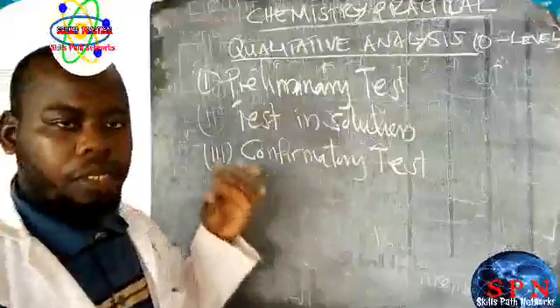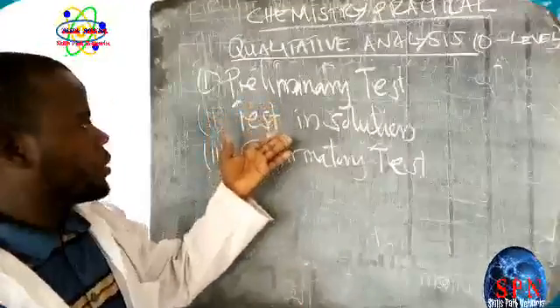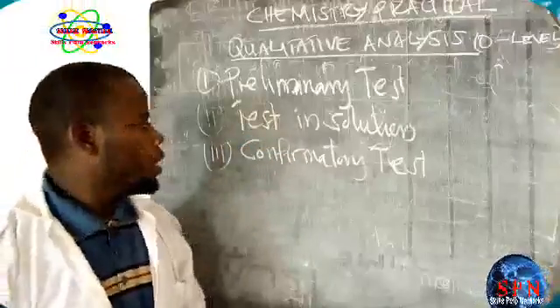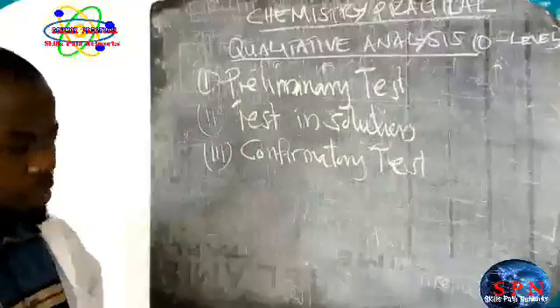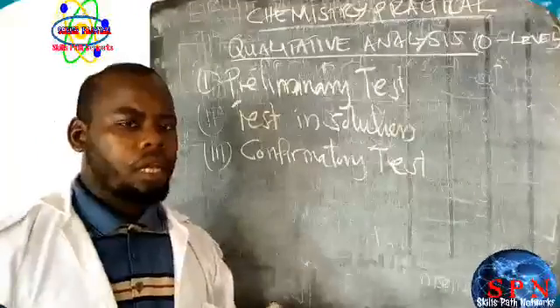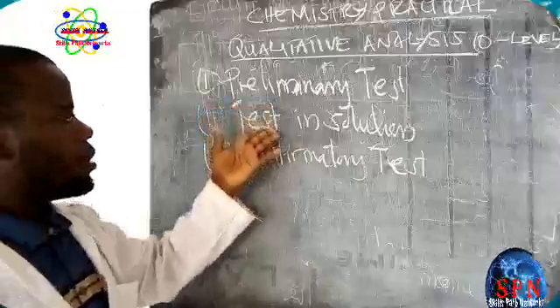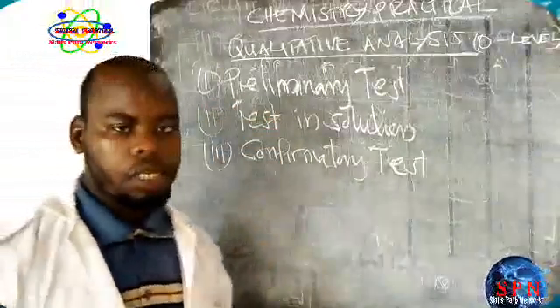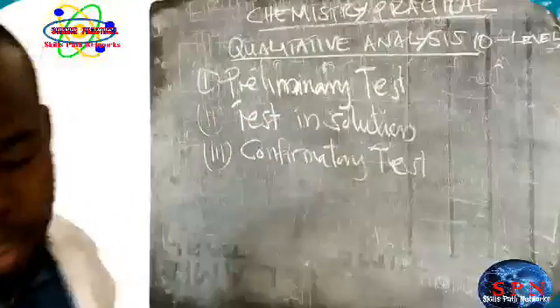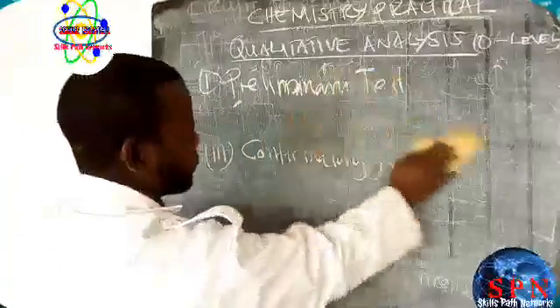So you perform the preliminary test, the test in solution, and the confirmatory test. Within these there are sub-procedures to follow until you reach the confirmatory test. Let's go directly to the preliminary test.